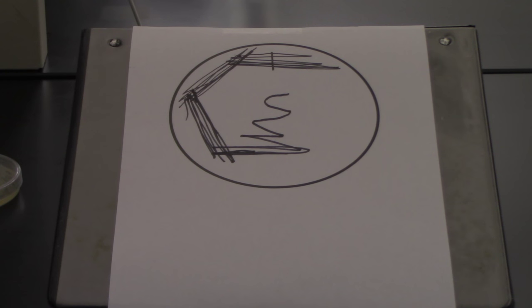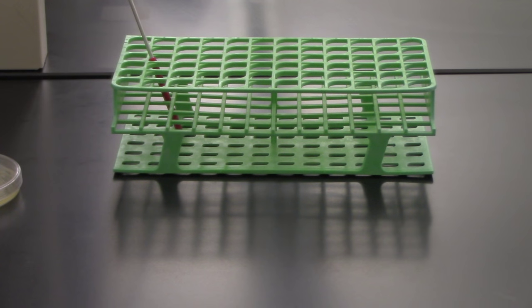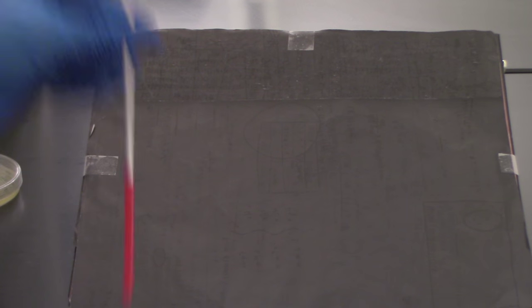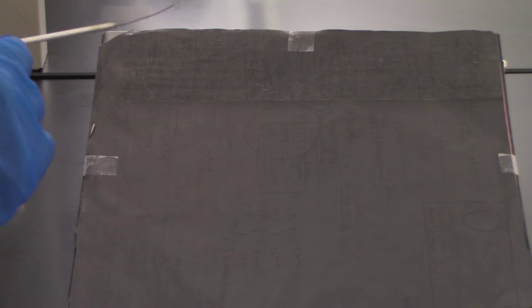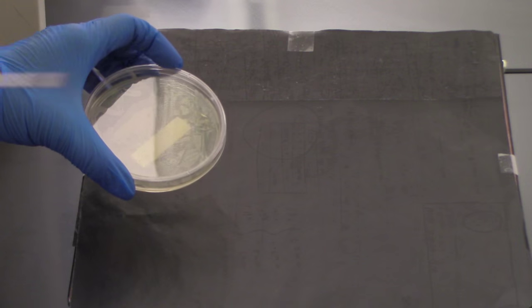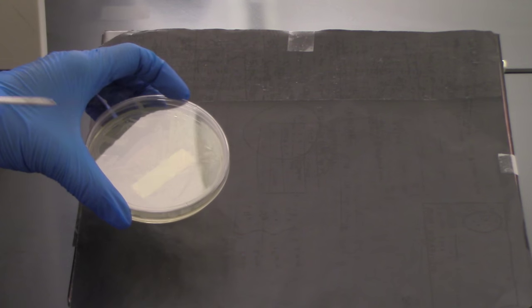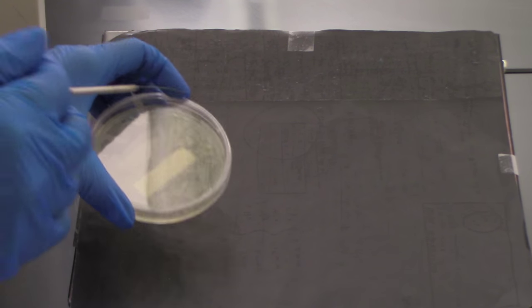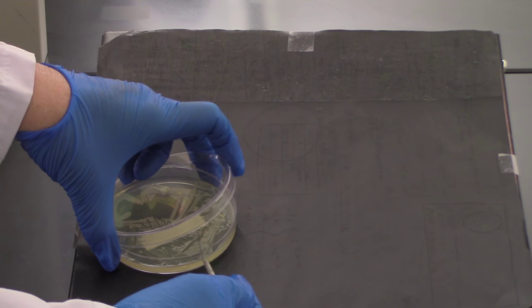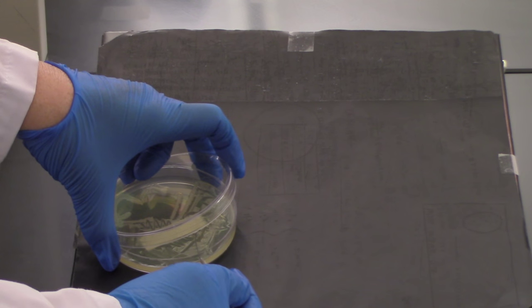Okay, so that was our demonstration — now I'm going to actually do the streak isolation procedure. I'm going to use my sterile loop. I have my starting culture, and you can start with a variety of different media — you might be starting from a broth or a slant. I'm going to be using a petri plate here, so I'm going to pick up a tiny amount of bacteria.